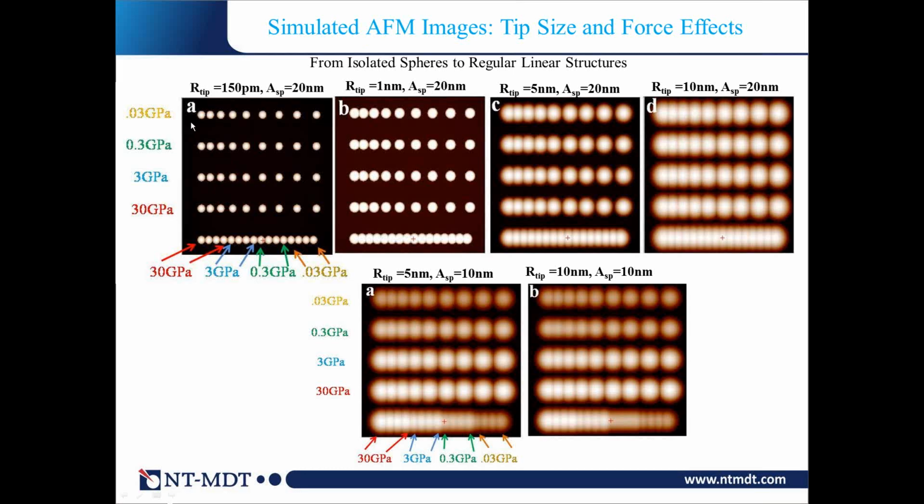If you have objects on the surface as small spheres of, let's say, the same size, but they have very different mechanical properties, and they are also positioned at different spacing between each other. In the bottom row, you can see kind of a continuous sequence of these small spheres or balls.